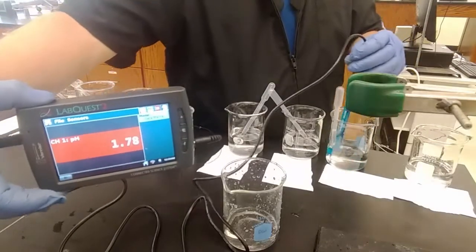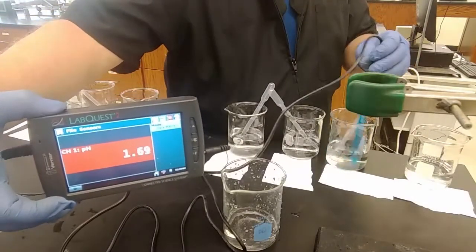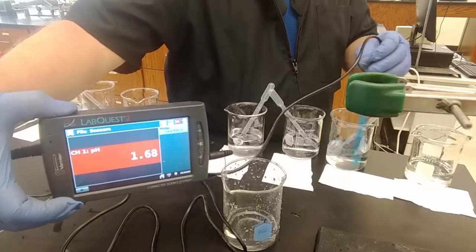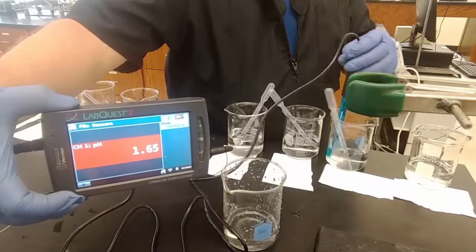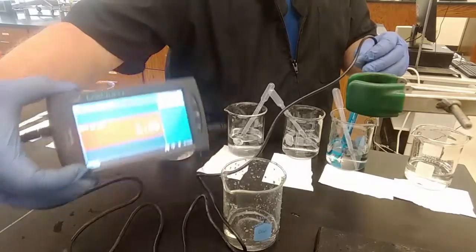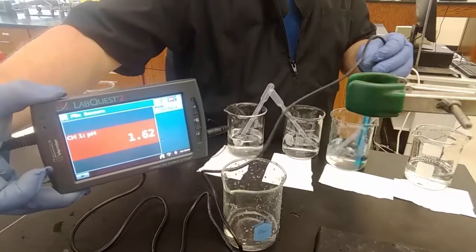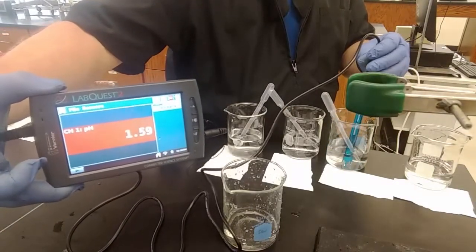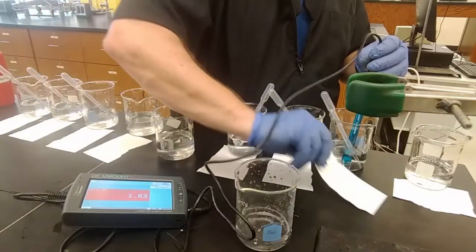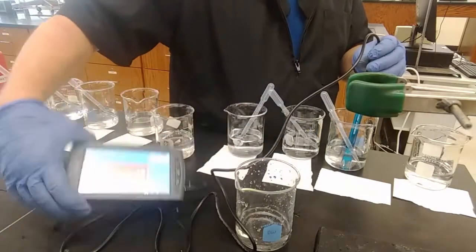Unlike the spectrophotometer last week, the pH meter takes a little while to equilibrate. I'm also jiggling it around because you can't have any air bubbles underneath the probe or it messes things up. So we're expecting 1, and it looks like we're at 1.63. Again, we were expecting 1, and we're at 1.63.